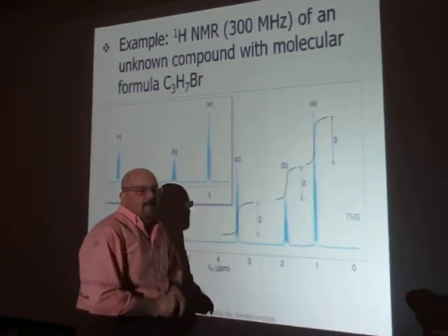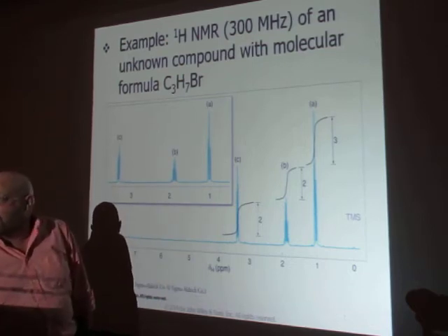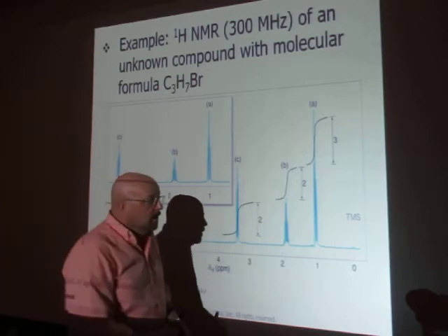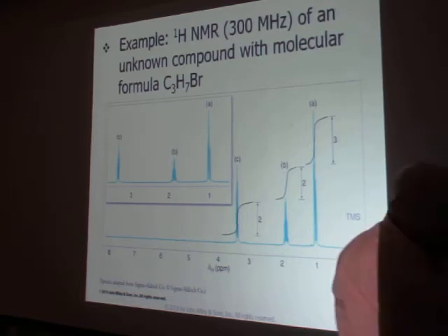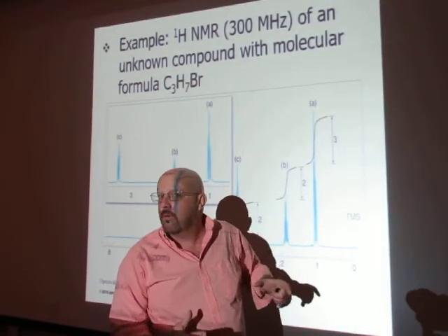Okay, I've got enough now. I've got enough of the puzzle. I can put it together and see what the picture is. See what the structure is. Let's start trying to piece this together. So we know we've got 3 carbons all total. And I've got more than that drawn here, so some of these are the same. I've only got 3 carbons, and I drew out 5 over here. So some of these are the same carbons.